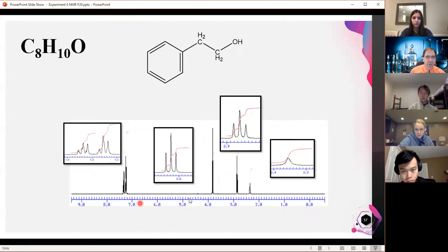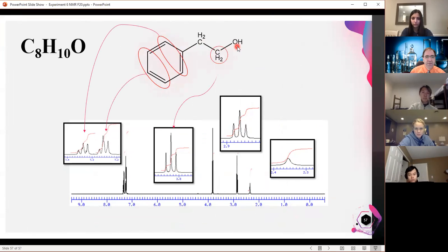And so I'm going to propose this. I said the aromatic ring had to have a single substitution, so everything else has to be hanging off there. I needed 2 CH2s that were each next to 2 neighbors, so they were both triplets. Now again, if you look at this one here, this is splitting it. This looks like it should also split it, but alcohols don't take part in the splitting usually. And so I can annotate it, and I can put all these things in place. Now, I drew these 2. You usually can't tell which signals go to which in the aromatic, so just pick ones, you're fine.